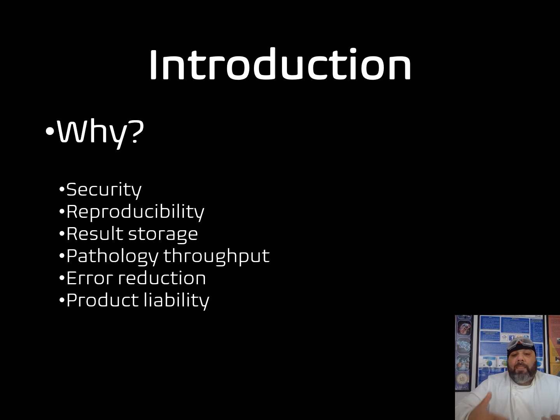However, generally speaking, pathology automation has allowed more investigations to be conducted, owing to ensuring that laboratory practices are in keeping with certain aspects of pathology accreditation, which then have to be in line with aspects of product liability as well. So I just want to highlight a little bit around this in the context of an introduction here.